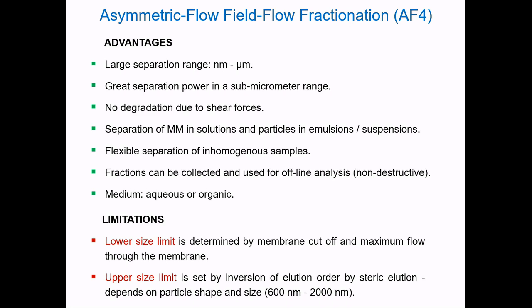Besides water, organic solvents of low to medium polarity can be used as the mobile phases. As any other technique, also AF4 has its own limitations. The lower size limit is determined by the pore of the membrane mounted on the bottom channel plate and by the maximum cross-flow rate through the membrane. The upper size limit is set by inversion of elution order by steric elution, and this upper size limit depends on particle shape as well as particle size.